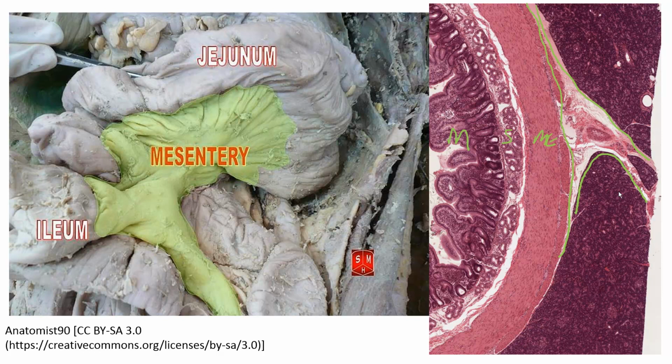The last thing I want to do to try to keep this video under 10 minutes is go through the 3 sections of the small intestine, because it is divided into 3 distinct histological sections, and show you the defining feature of each section and talk a little bit about why each section needs that defining feature.